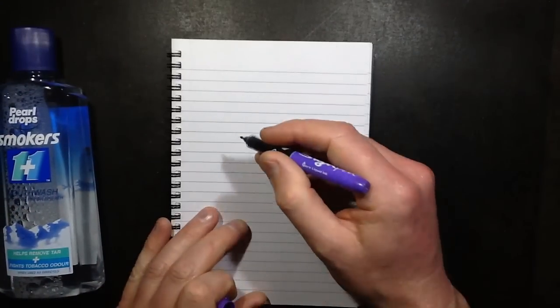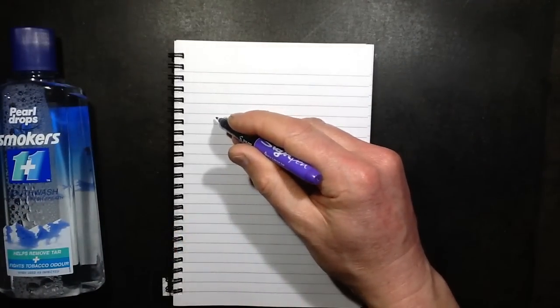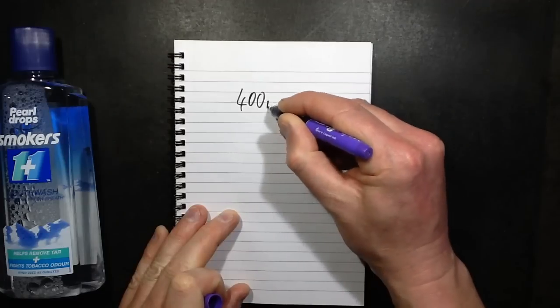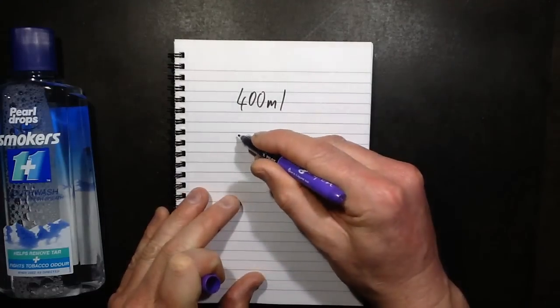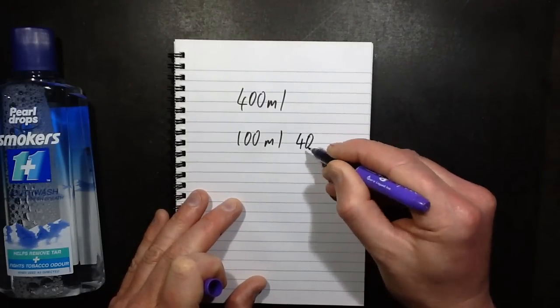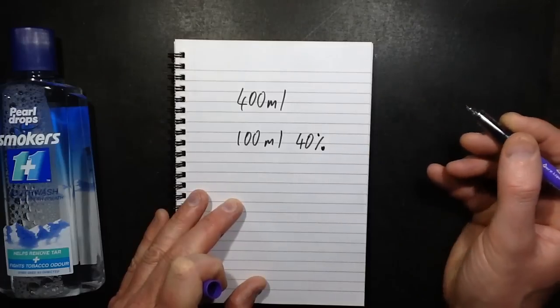It initially came out extremely high, it was off the scale, but at about, this is 400 millilitres, and I ended up with 100ml of roughly 40% alcoholic solution.